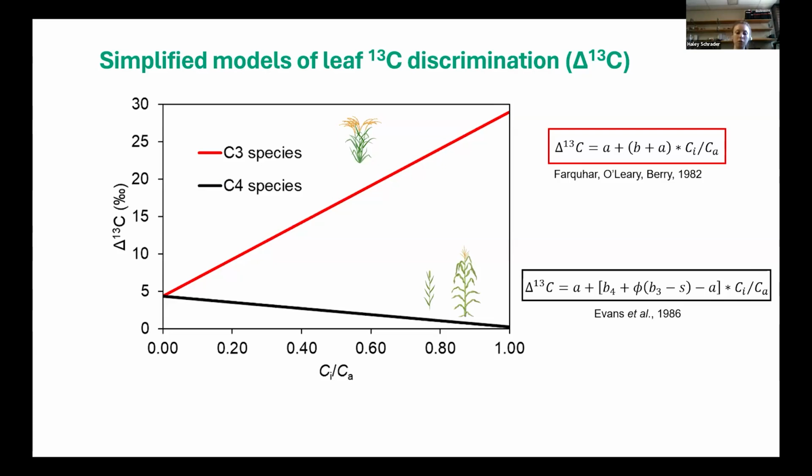So as I mentioned, our goal was to test this LI-6878 system in terms of how carbon-13 discrimination responds to both light and CO2 availability. And with that, I'm going to transition to 2 other Cousins Lab members. First, Rita will show you her tests on a C3 plant, followed by Diego with a C4 plant. And give us just 1 minute to transition over.